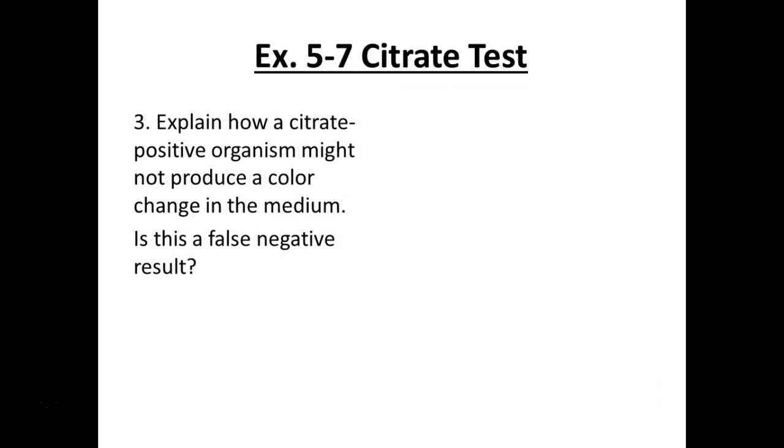So explain how a citrate positive organism might not produce a color change. Well, think about it. Think about your organisms. What they need to grow, right? And they need to use a lot of it to cause this pH change. So what factors would affect its growth? Incomplete incubation, maybe the wrong temperature, right? Someone stuck it at a cooler temperature, it's growing slower.